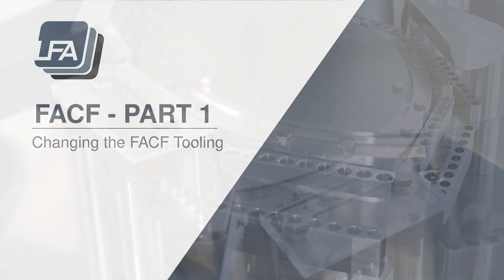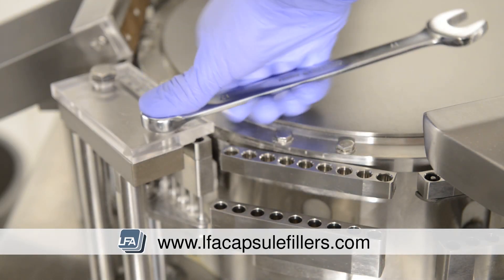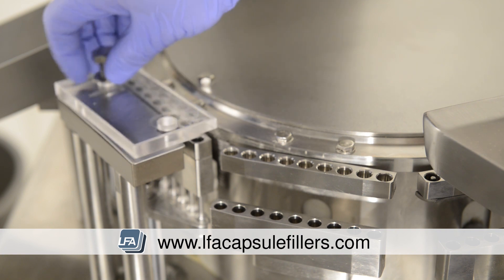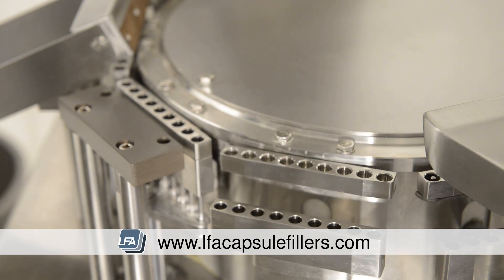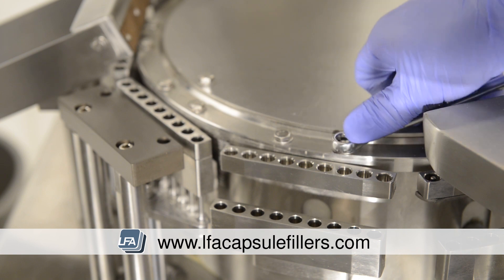First we need to remove the capsule closing plate. Undo the two bolts at the top and remove it. There will also be a small metal plate — remove this and put it to one side. Next we're going to remove the top section of the tooling.